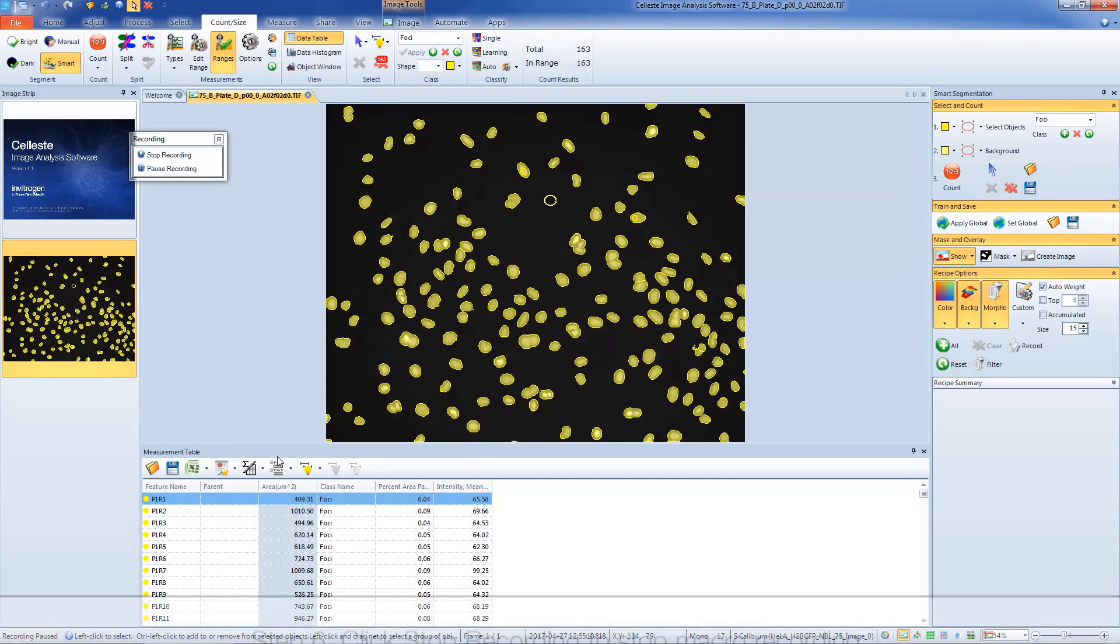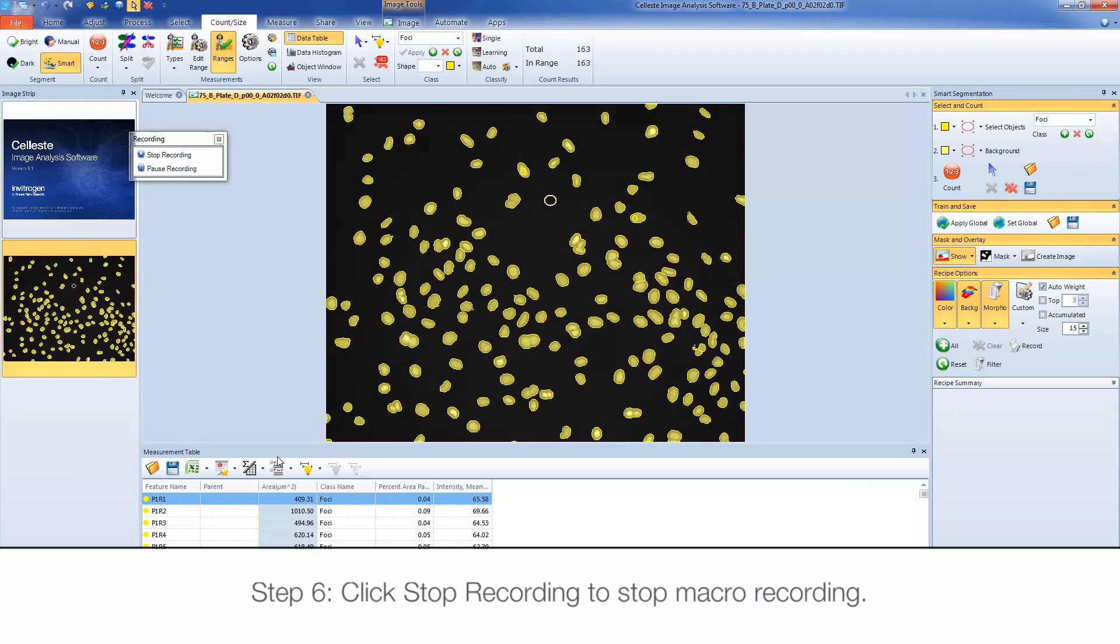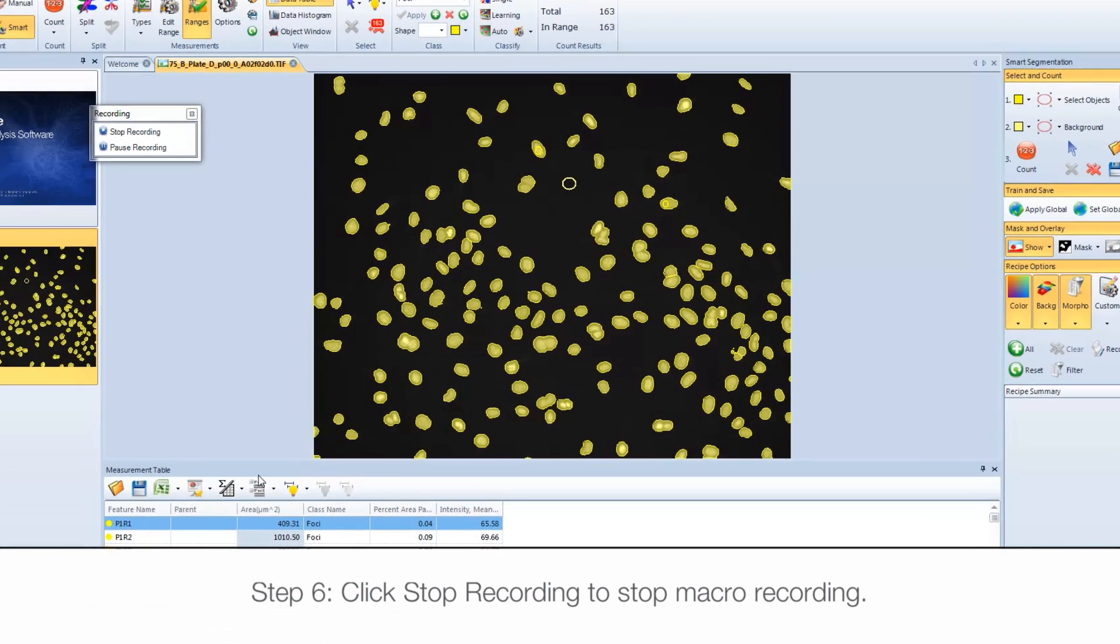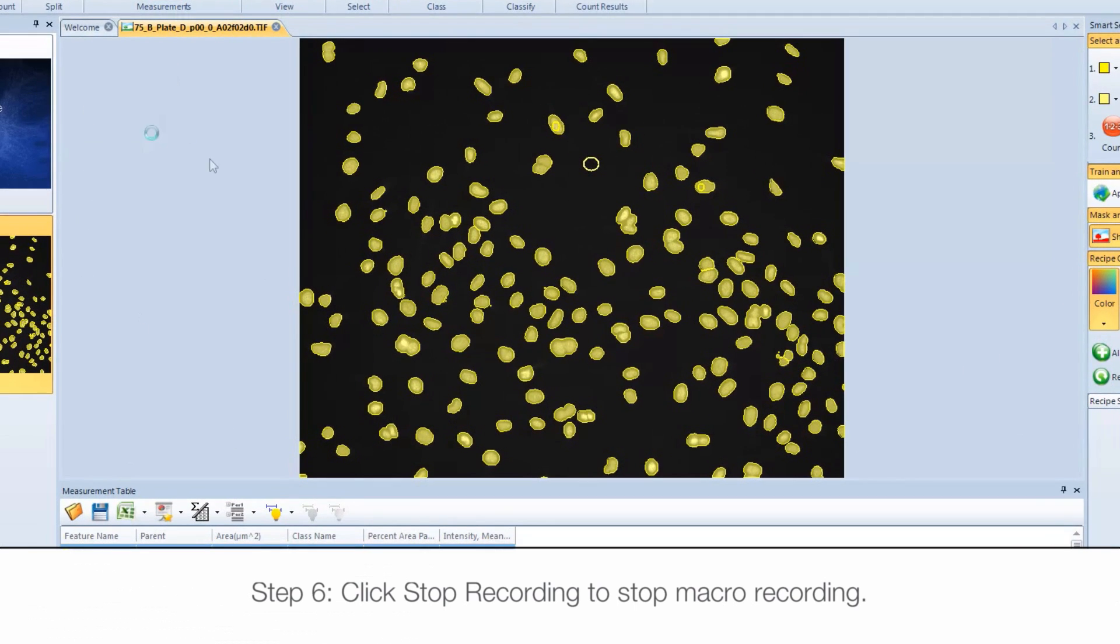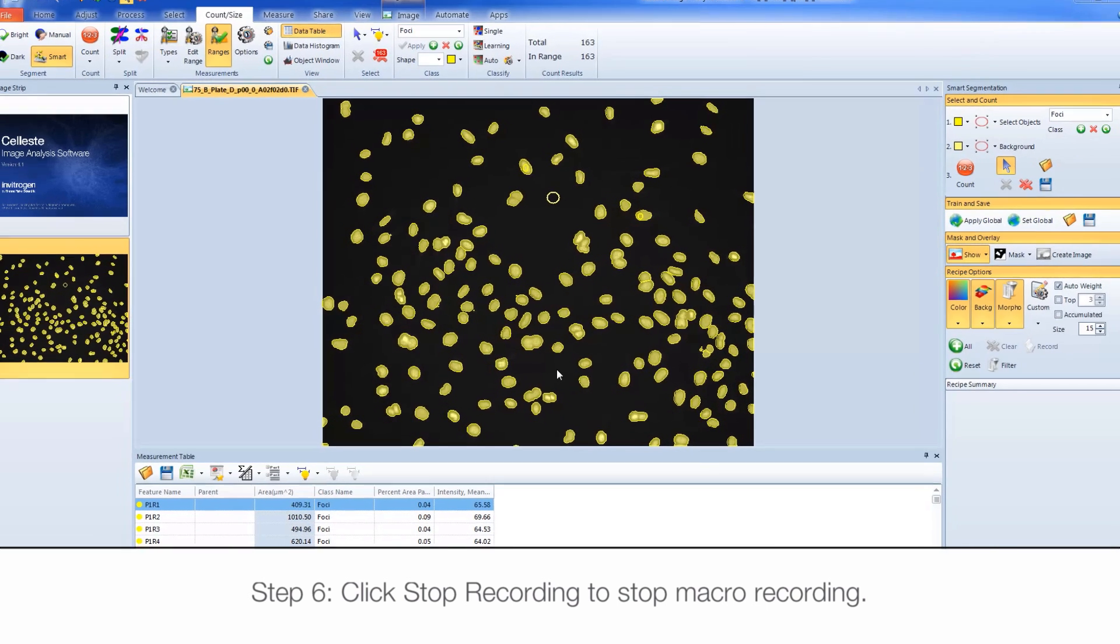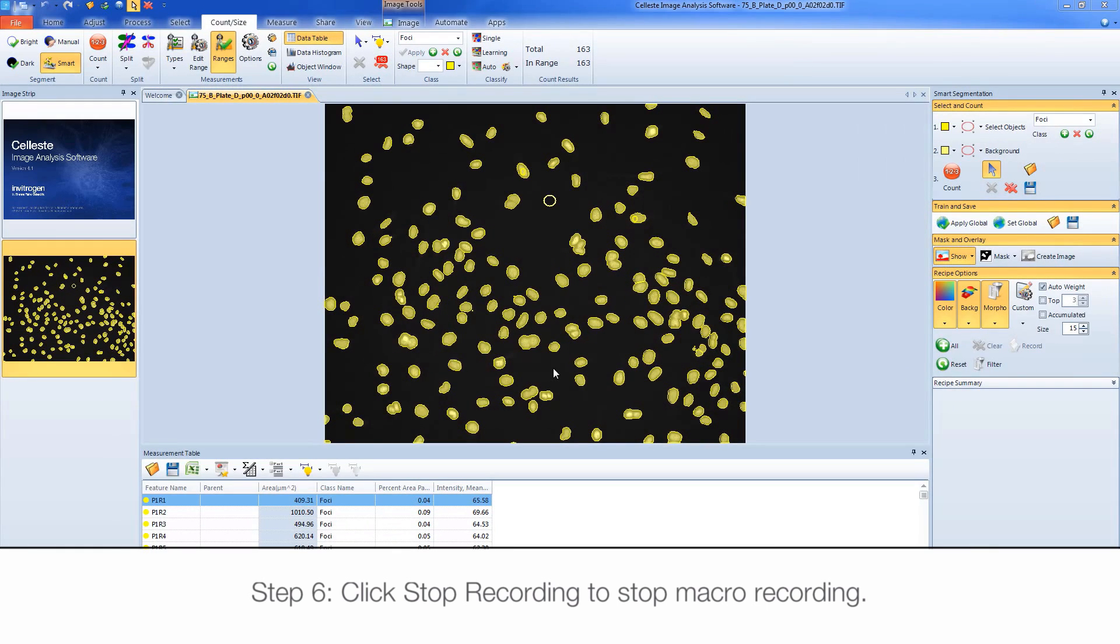Once you're done setting up your macro, press the Stop Recording button and click Yes to save the recorded macro.